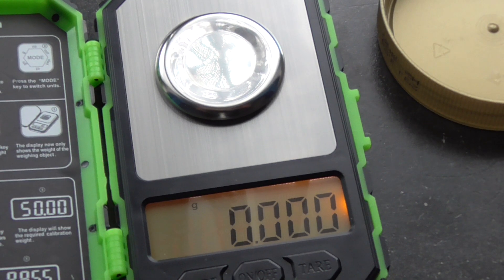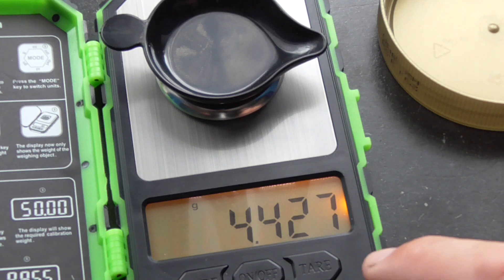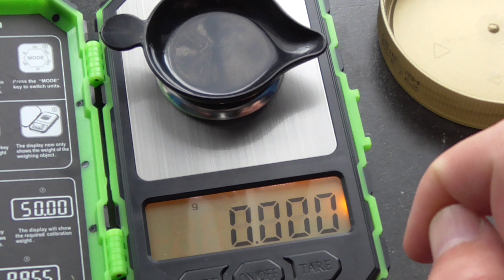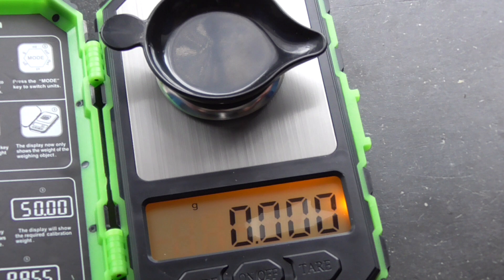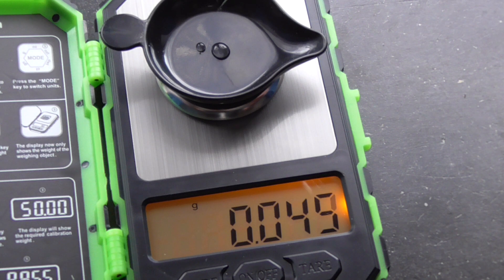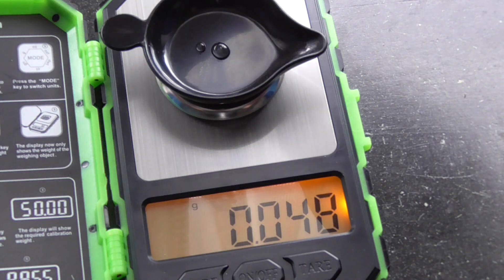Now back to zero. I'll put this bucket container on it — of course it shows more, so we have to use the tare function to subtract the weight of the bucket. Now we have to be a little bit quick so it doesn't evaporate too much. Start counting the seconds — okay, now I put it inside the bucket. We already have 48 milligrams.